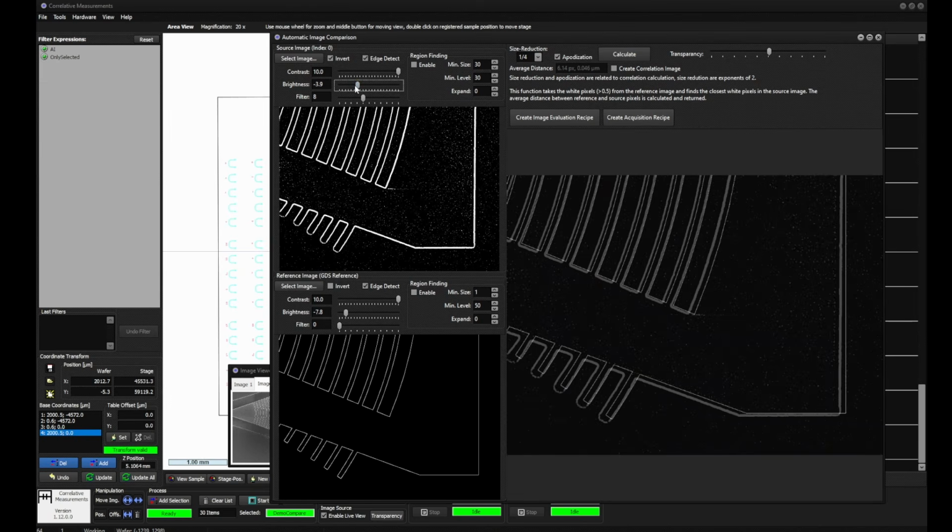So that I should really put it here. Maybe the imaging was not perfect, and maybe the focus was actually not perfect. One should redo it. But yeah, let's try to get it better. When we activate now the region finding here, we can get away with this noise in the background, and I think this should be still good enough.